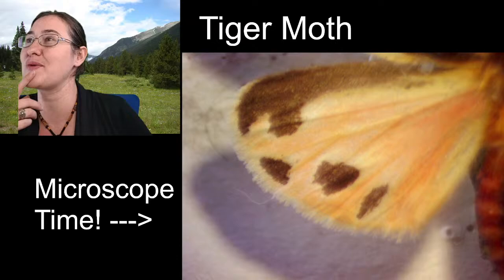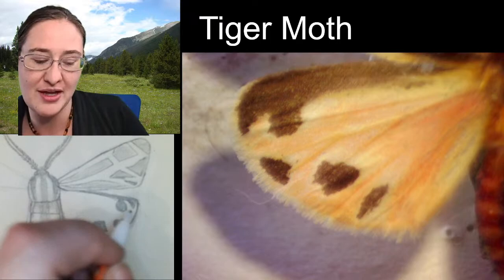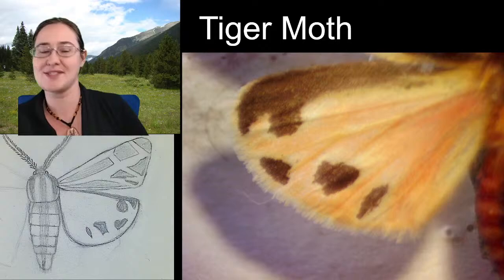It is really easy to see the wing venation over here on the hindwing, and there's part of me that wants to add it just because those spots don't feel like enough to me. So here we go. There's only one more vein that you can't see very well. There is a cross vein around here that comes down and finishes this cell. So when we sketch it, I'll show you that. Here we go.